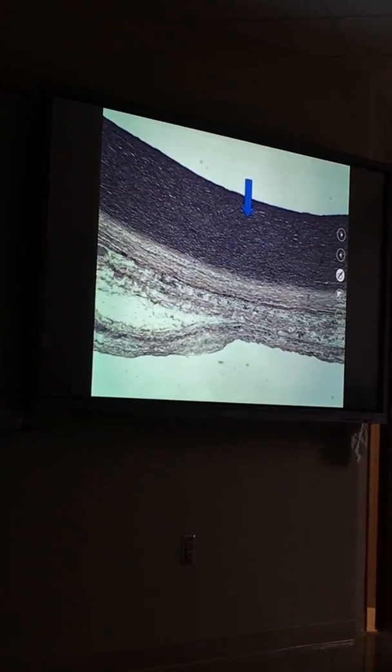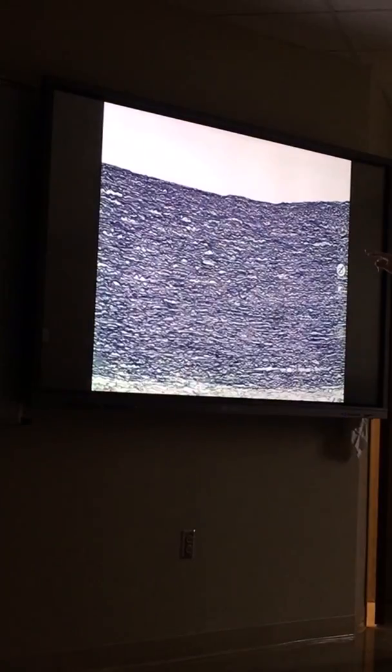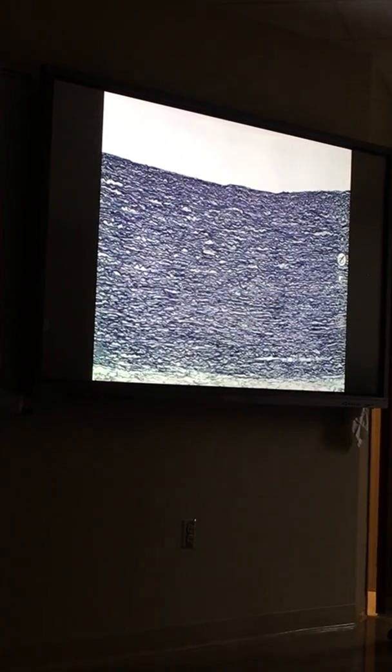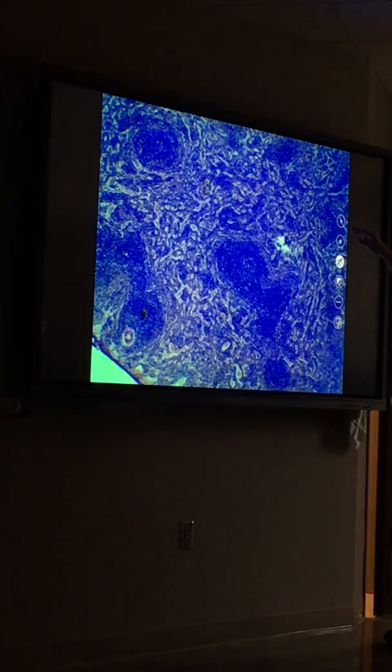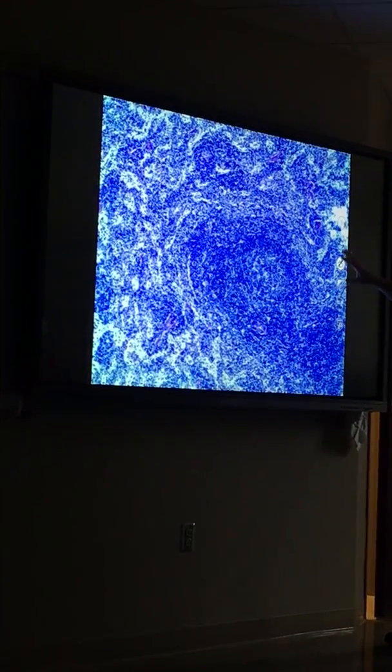Okay, then we had elastic connective on the aorta, right? We saw some of the little arteries later, but that's a good slide there. Probably won't use that, probably back it up to 100 power here on the test. Okay, and then we had reticular, which we said would be all the dots, probably at 100 power.